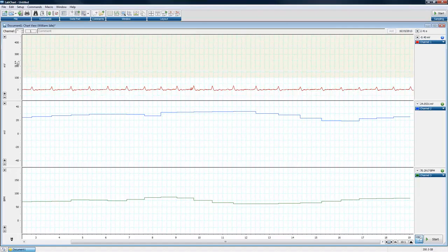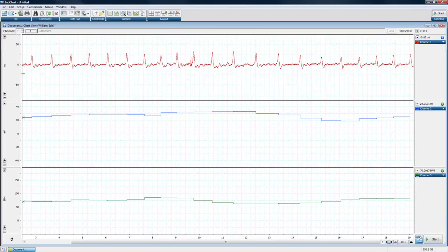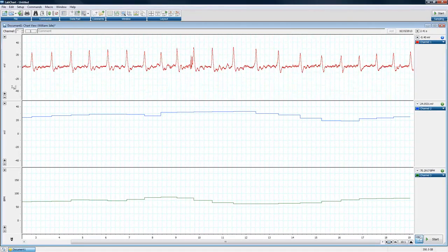And I can do the same thing here on the top. If that bar is shown, that bar is locking the bottom axis, I can click and drag the top axis, and I can expand the top axis and zoom in that way. Okay, so there's quite a few things I can do here in terms of changing the way the axis is shown. I can do it manually. I can also use the plus and minus buttons as I showed you before.